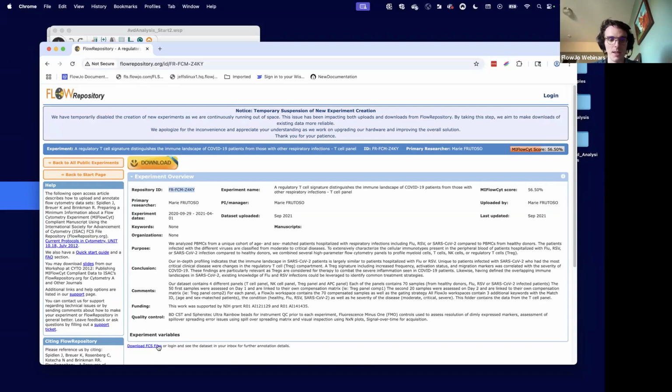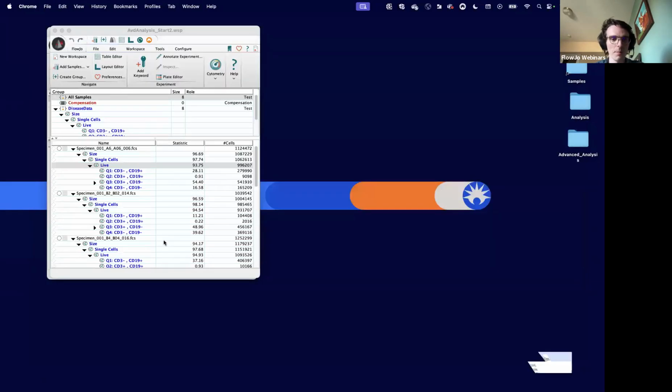You can download it here. It's a great data set. Appreciate the author for making it available for us to use in open source fashion. And so I'm going to go ahead and dive in.